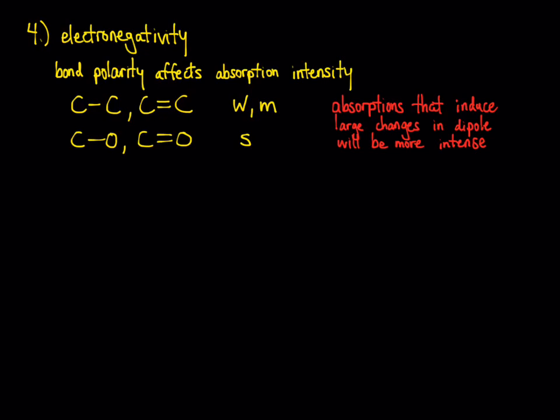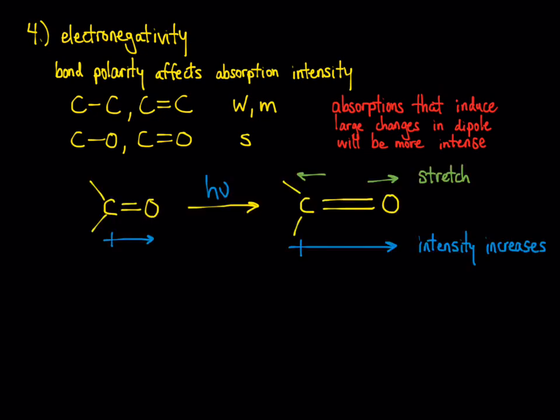This is because as infrared light causes stretching vibrations, bond dipoles will actually change. If a carbon-oxygen double bond lengthens, the bond dipole will be stronger. This increases the intensity of the IR band.